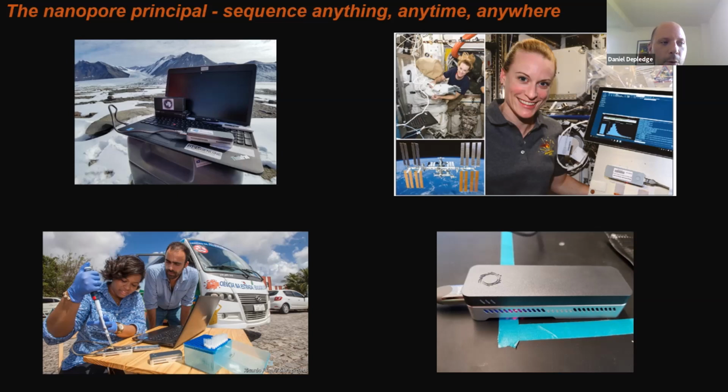If people are interested in learning more about the current COVID-19 outbreak, there is a website called, oh, this is embarrassing, I've blanked on it. It's called ARTIC Network. It sounds like Arctic, but it's ARTIC. This is basically a UK consortium that have put together protocols for sequencing directly from patient samples on the Nanopore, and then capturing the virus and immediately uploading it to NextStrain, so they can track outbreaks almost in real time, seeing where infections are coming from, where they're going, and how they're spreading in the community.